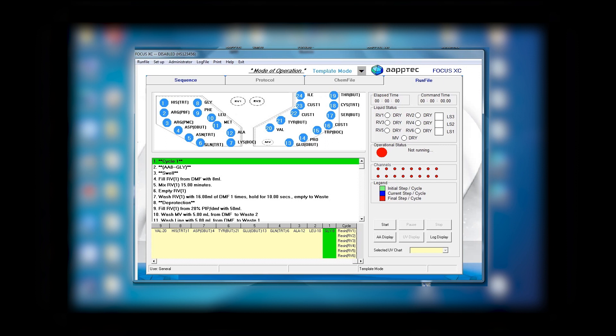When the synthesis is occurring, the blue color shows you where you are. For example, when we are doing glutamine and it is in step 4 or step 5, you will see a blue color. If the color is red, you are at the end of the process. You can also stop the process anywhere else you wish by selecting a line and clicking stop.